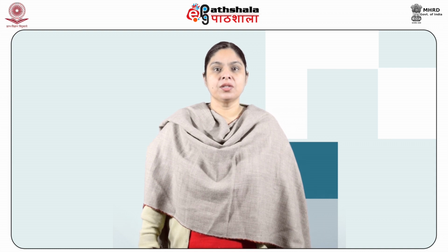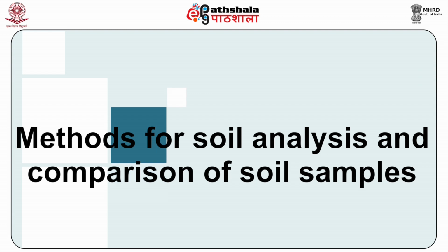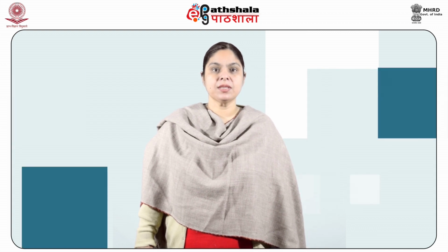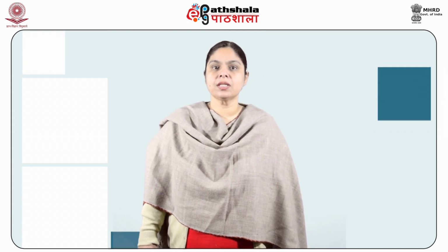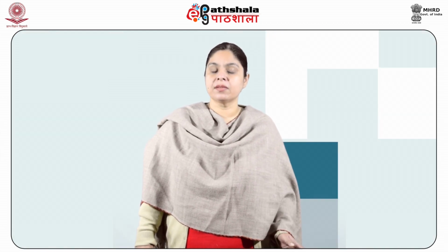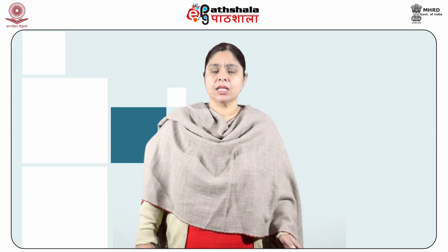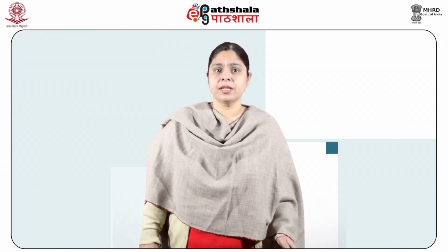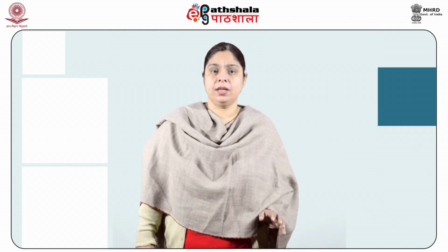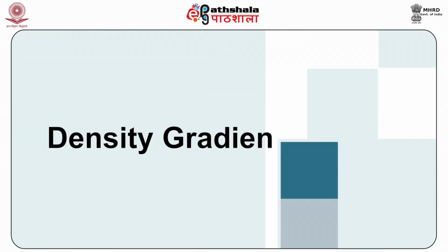Let us now come to a brief discussion about the different methods for soil analysis and the comparison of different soil samples. In order to find a link between a suspect and the crime scene, forensic investigators most of the time find it very easy as well as very beneficial to compare the soil samples themselves. For this, a very thorough analysis is required. Here we are going to discuss two very common methods for soil comparison. One of them is a very well-known method, the density gradient method.